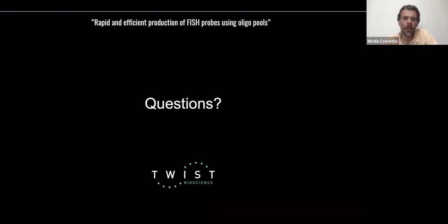In our experience, we routinely work with targets in the range of 10, 20, 30 kb. We have gone down reliably to detect 3 kb.